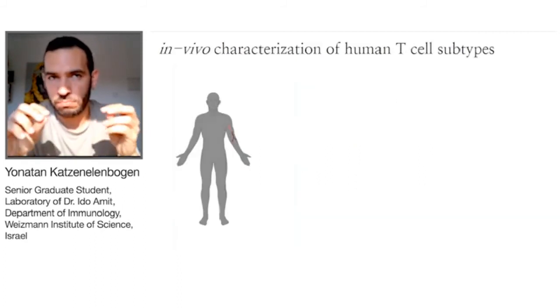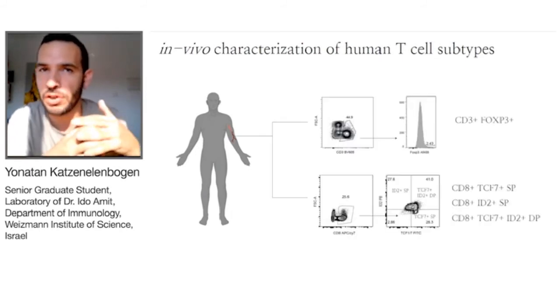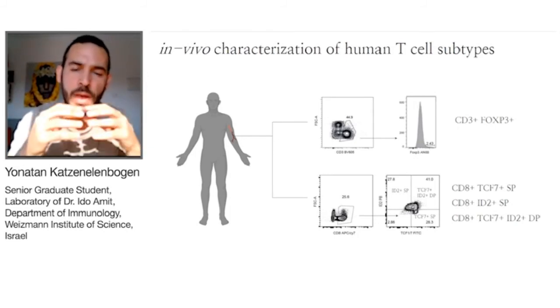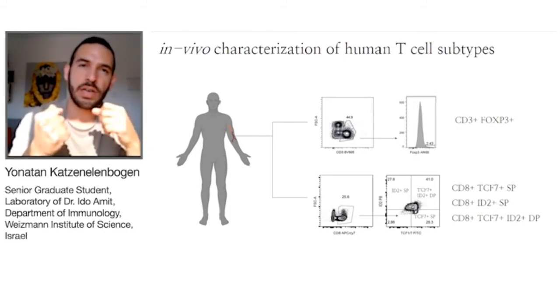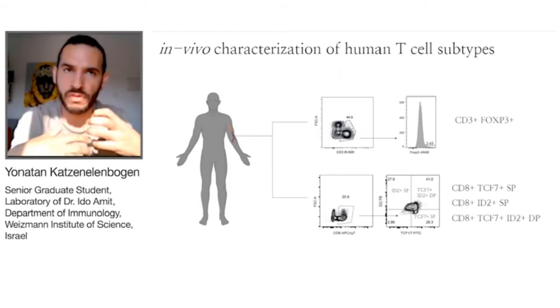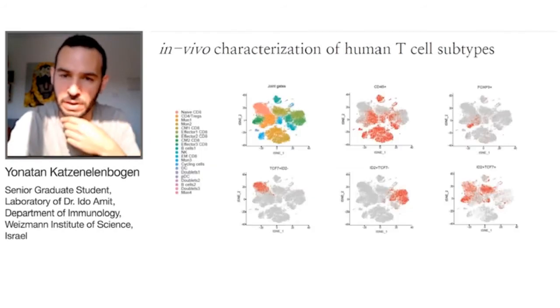We also targeted some transcription factors from T cell population within human blood, so we produced this transcription factor map, isolating cells according to the expression of a specific transcription factor, then profiling them using single-cell RNA sequencing. We had beautiful 2D maps that you can appreciate here.